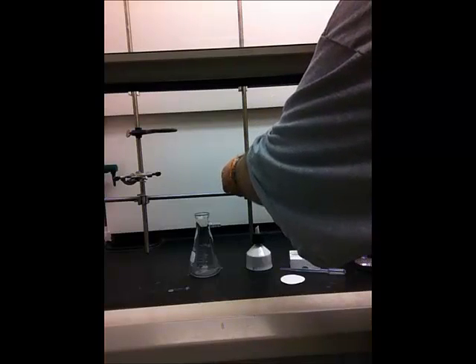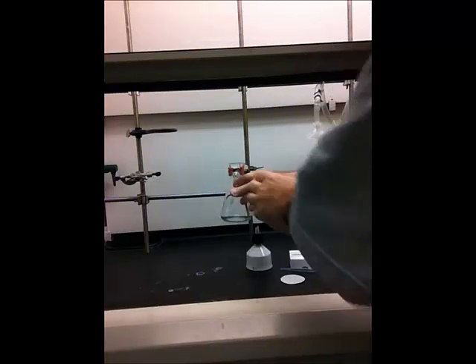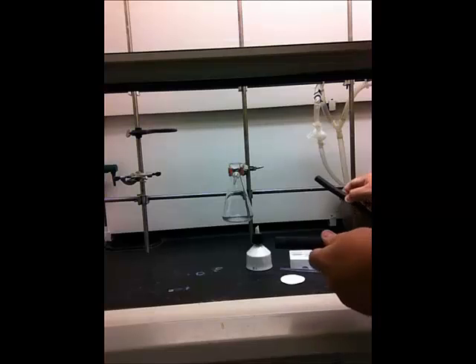To set the apparatus up, first set up the large clamp and then clamp the neck of the 250 milliliter filter flask onto it. Make sure the apparatus is really tight — ideally it can sit on the bench surface as well. Just make sure it won't tip over, because if the filter flask is under vacuum and tips over, it can implode. So make sure it's clamped securely.